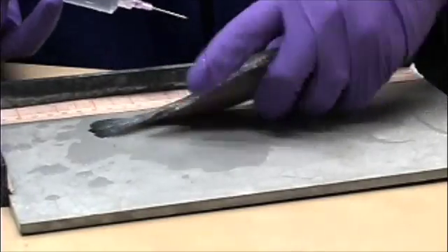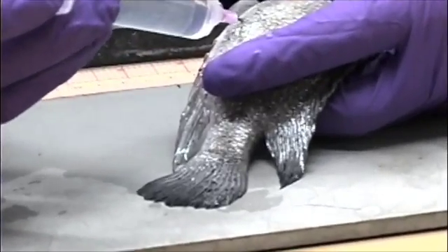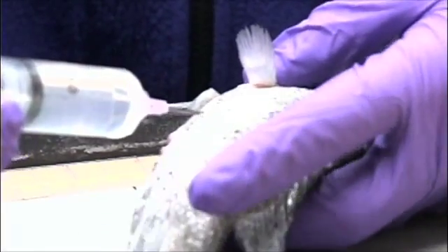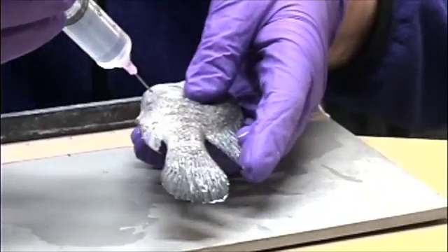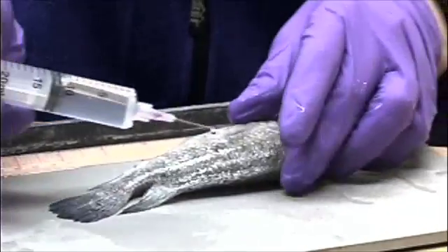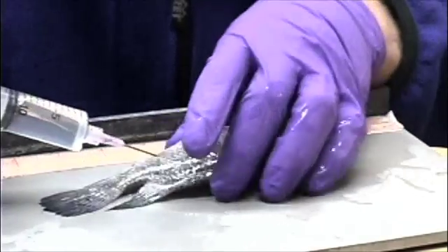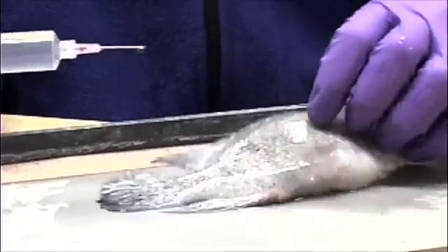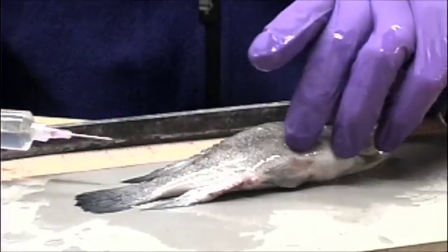Basically what I'm going to do is find a scale and insert the needle underneath, behind a scale, into the gut cavity. I can feel when I'm in, then I'll squeeze the formalin in and move it around, trying to get it through a few organs. I'll try a couple other places to make sure I get it really well preserved. Every time I'm going underneath the scales so that I leave the scales in place. And for a larger fish, I'll also try to get some of the musculature preserved deep inside using the same technique.